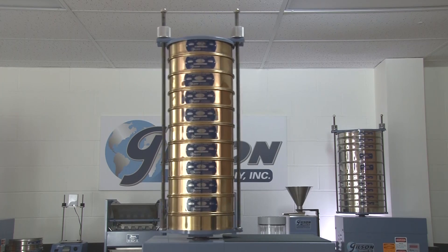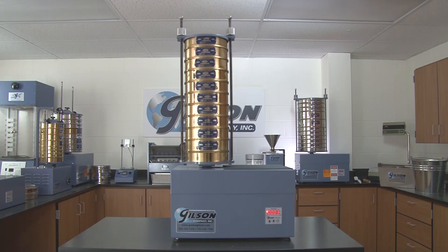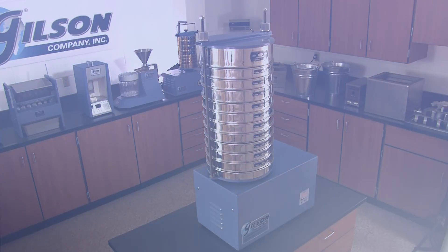Powered by a reliable one-third horsepower motor, the Gilson tapping mechanism is internally counterbalanced to ensure stability during operation. And since the unit does not require permanent mounting, it can easily be relocated.